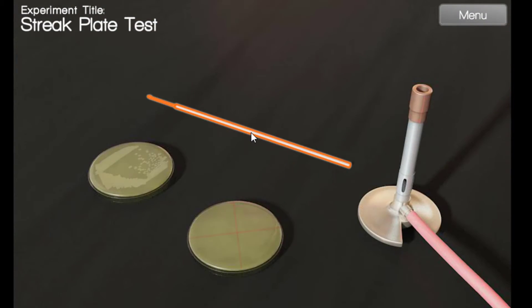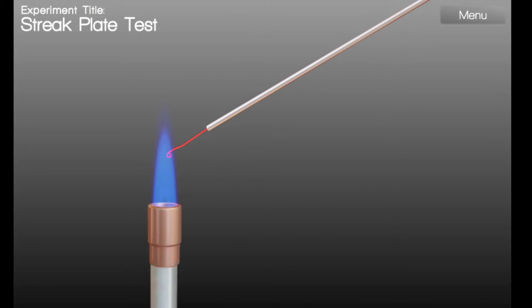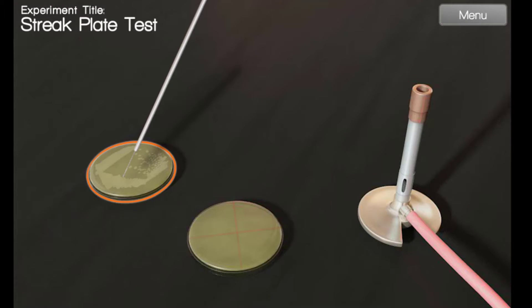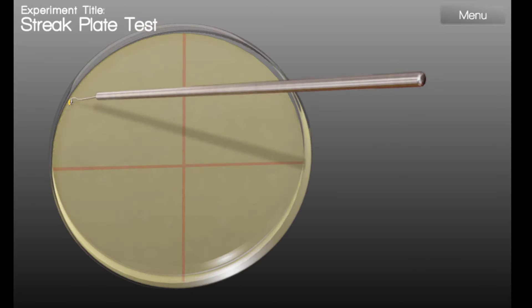Let's look at the steps of our procedure. First, we are going to sterilize the loop in the flame and allow it to cool. Then, pick an isolated colony from the agar plate and spread it over our new agar plate in one of the quadrants only.